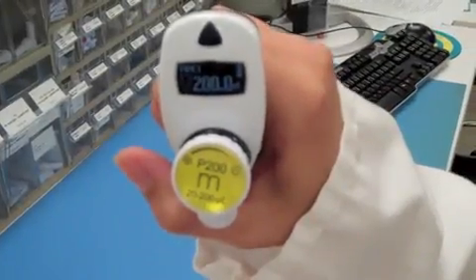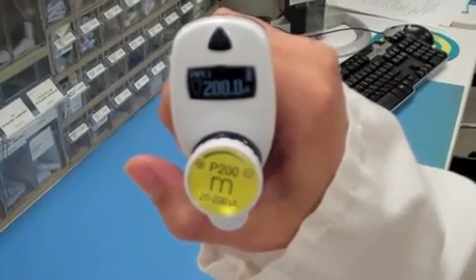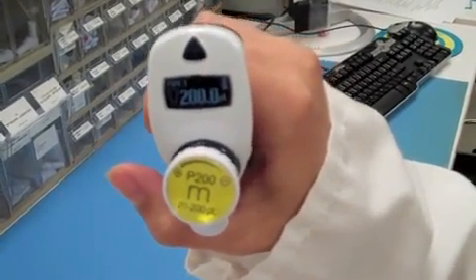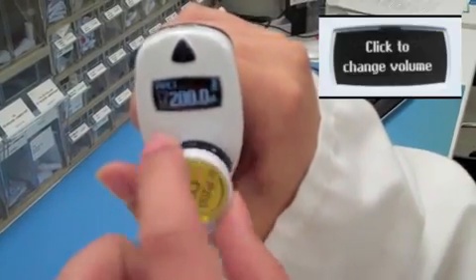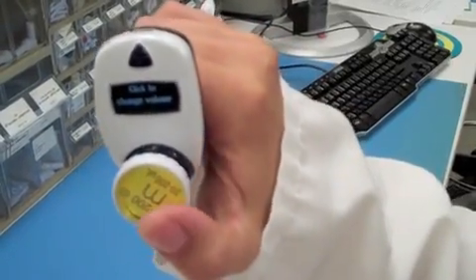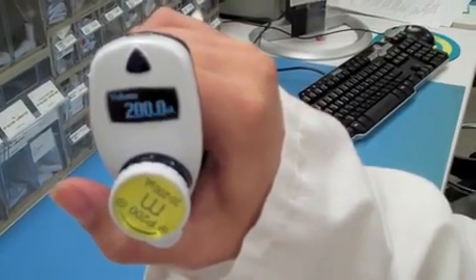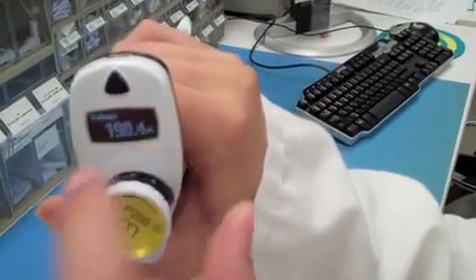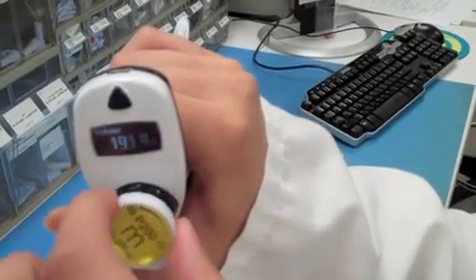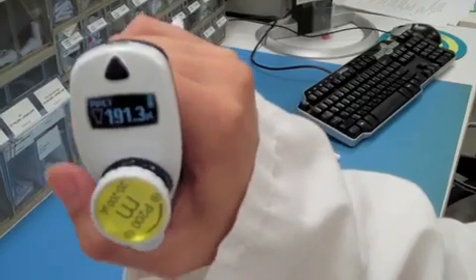The Pipetman M is extremely simple. There are only two buttons required to access all menus. First, to change the volume, you simply turn the push button a half turn. The display will read, click to change volume. Click the button. When the volume is flashing, you can now turn the push button and change the volume. When you have it set, simply click the push button again.